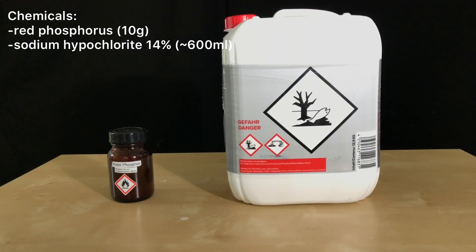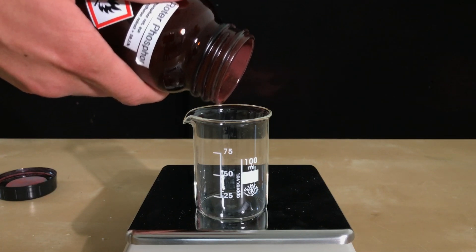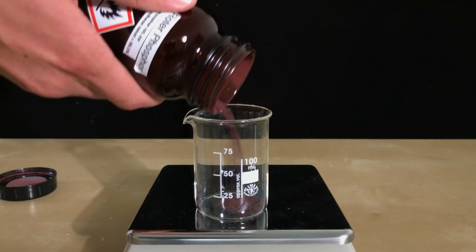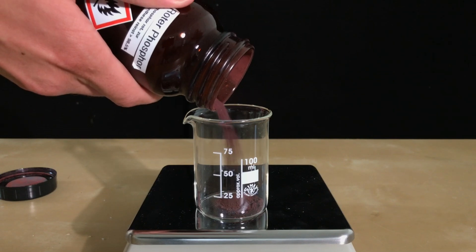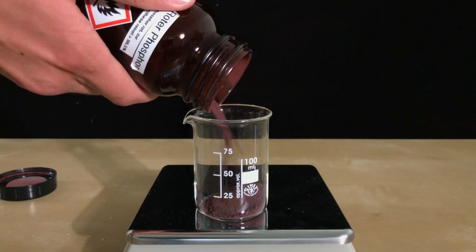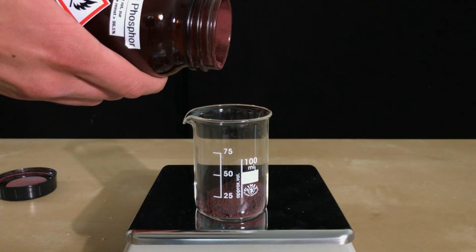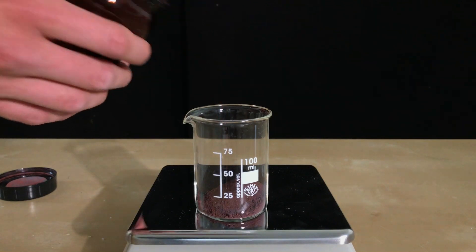To do this we are going to use 10 grams of red phosphorus and about 600 milliliters of 14% sodium hypochlorite solution. Exactly 10 grams of red phosphorus were weighed out. You shouldn't repeat this, but if you do, keep in mind that not every brand of red phosphorus contains violet phosphorus.